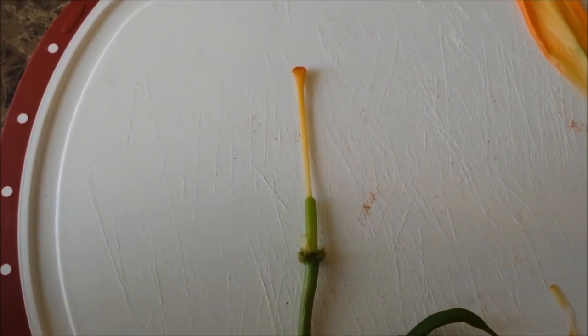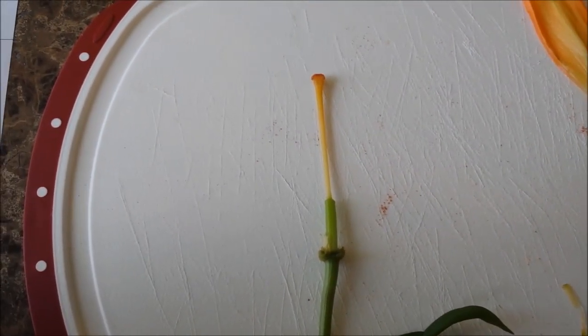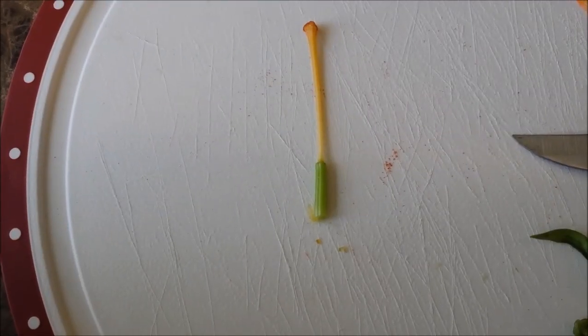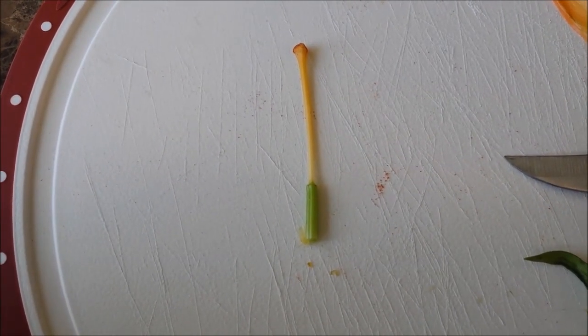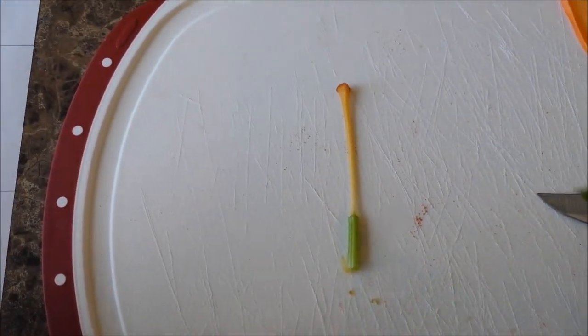There's the petals and the sepals. There's all the stamen. Next we'll be removing the pistil, which is where the seeds are formed in the flower. You can see where I have removed the pistil from the flower. Here's the poor stem.